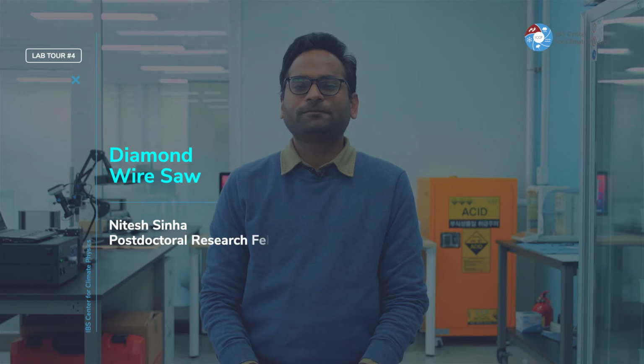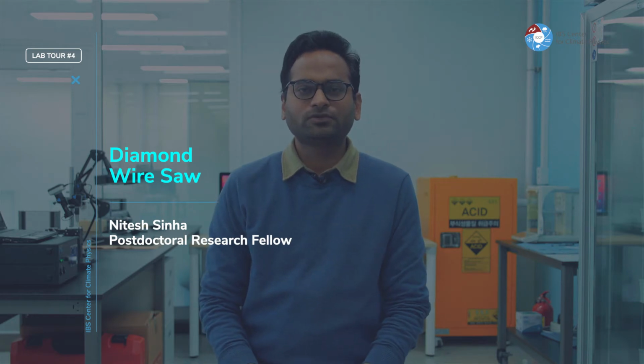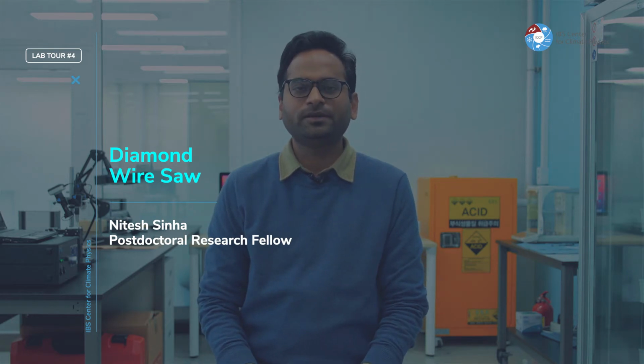Welcome to the ICCP lab tour. My name is Nitesh Sinha. I am a postdoctoral research fellow here at ICCP. One of the main goals of my research is to obtain isotope-based climate reconstruction using South Korean speleothems. So I will be introducing you to our sample preparation room and mass spectrometry lab.